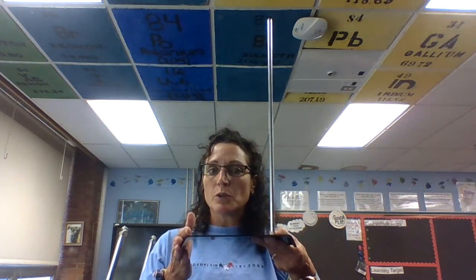The purpose of a ringstand is to be used in a lab that helps hold or clamp in place other laboratory equipment. I'm going to set one up for you so you could get better visualization.